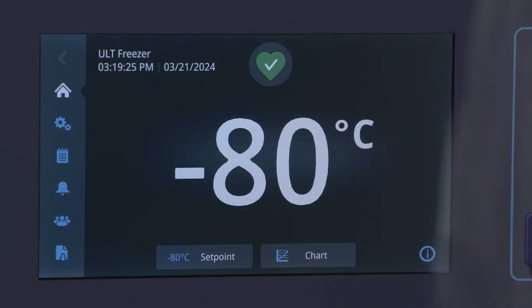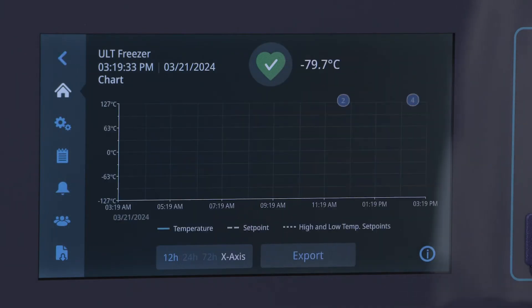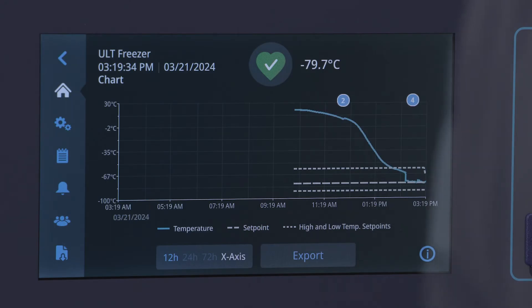Returning to the home screen and selecting the chart button, you'll see a simplified chart view where both temperatures and events can be plotted.